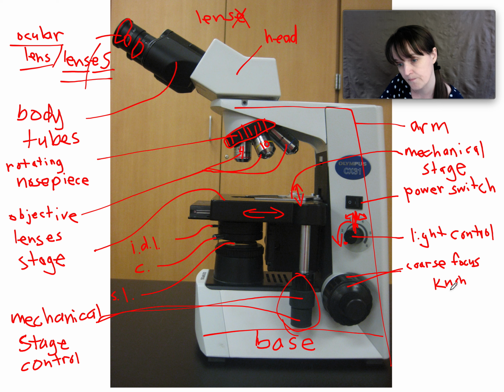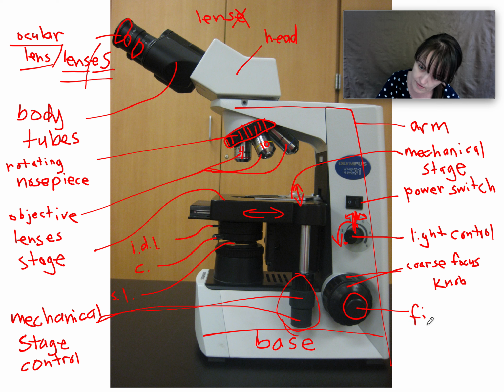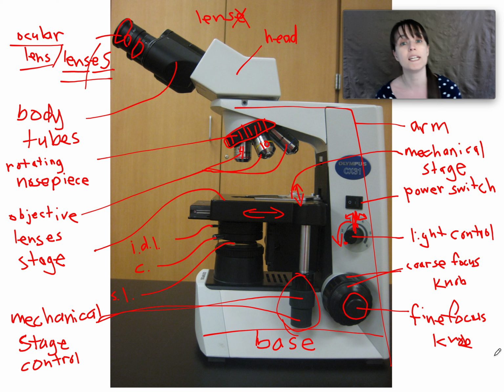knob. And then this smaller one is the fine focus knob. Focus knob, or fine adjustment knob, either way. So this is the majority of what you need to know.